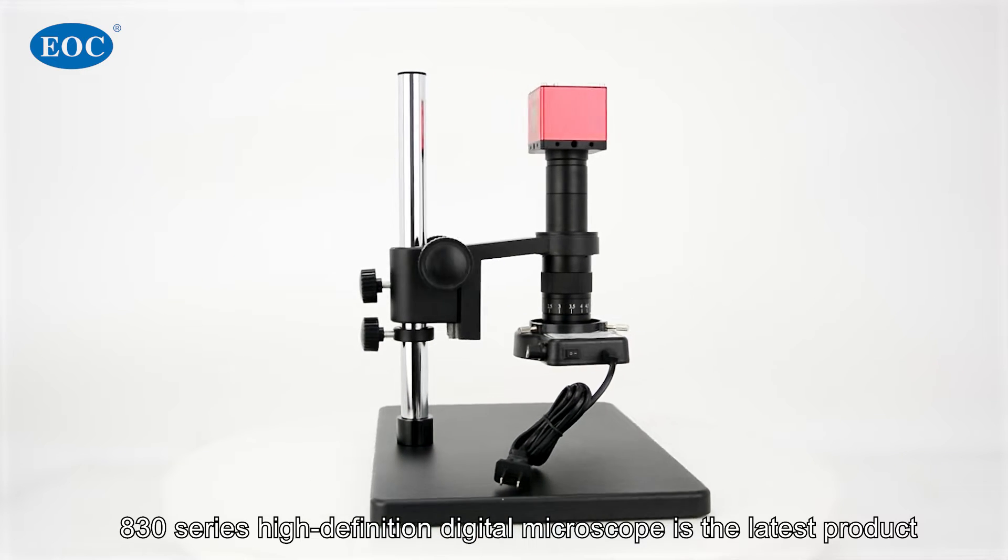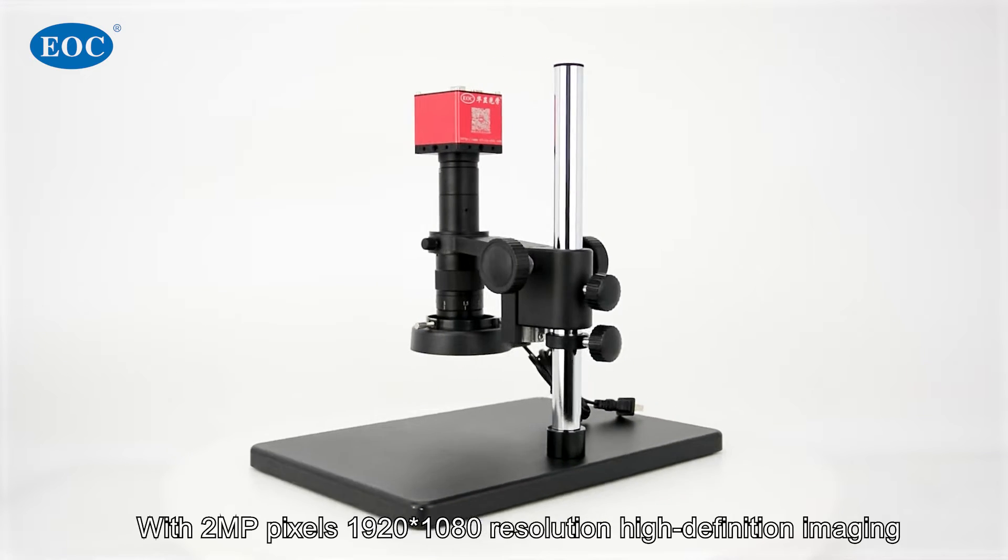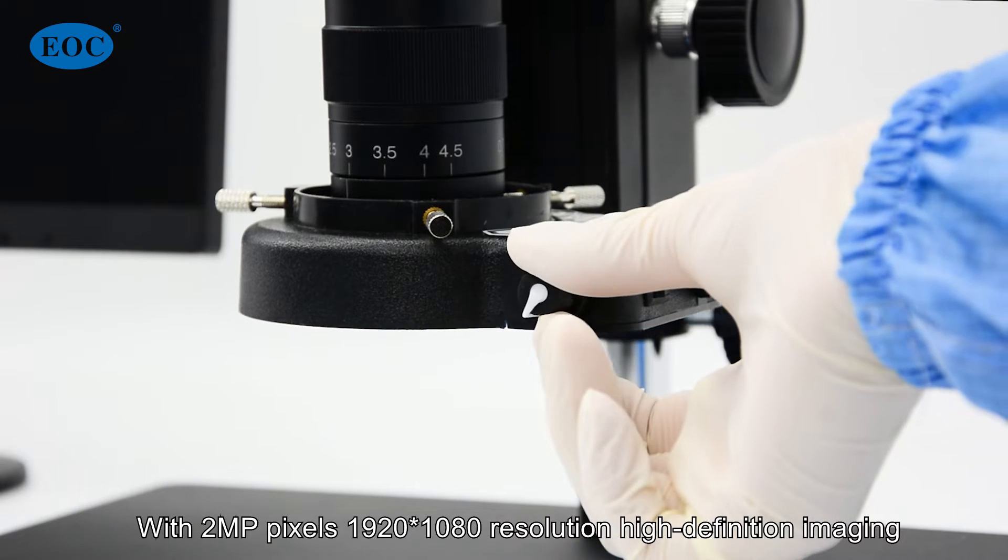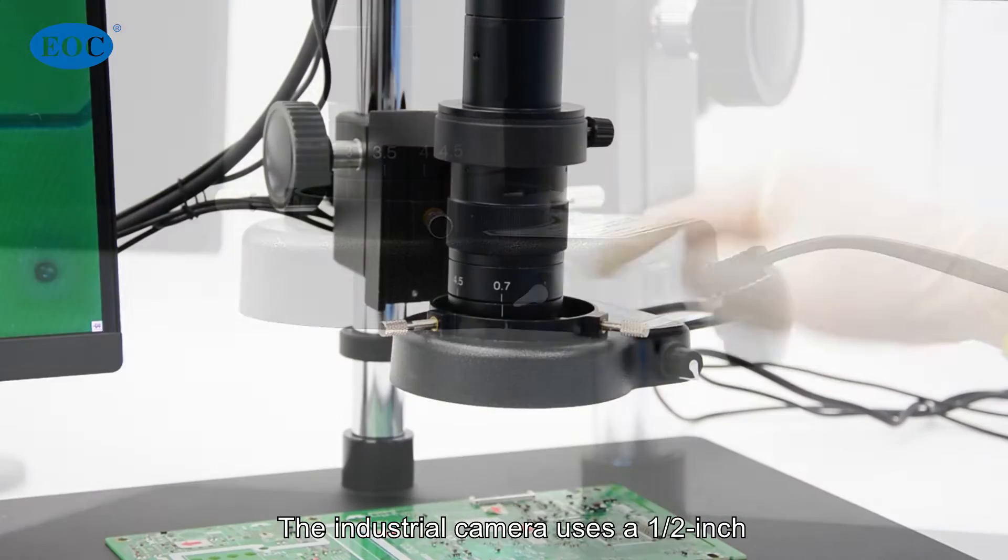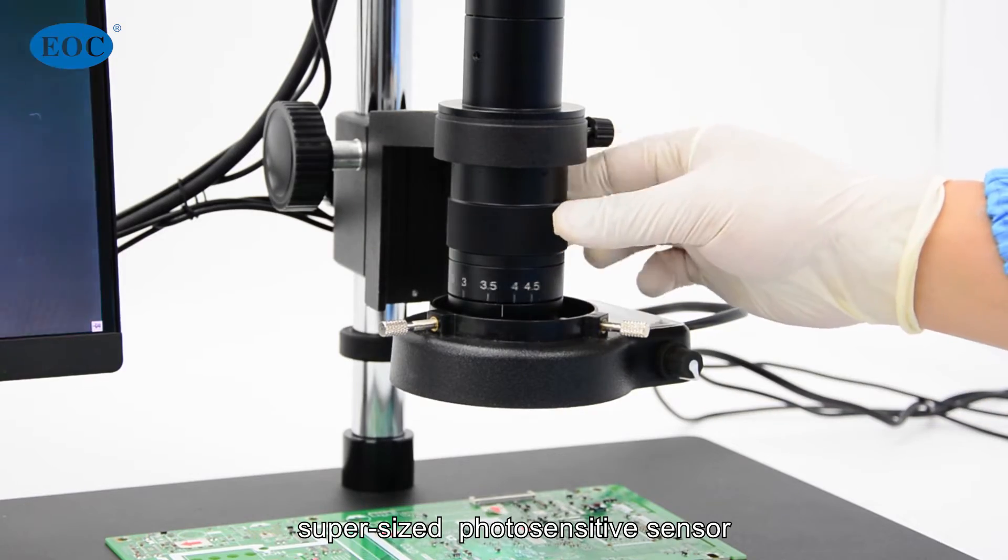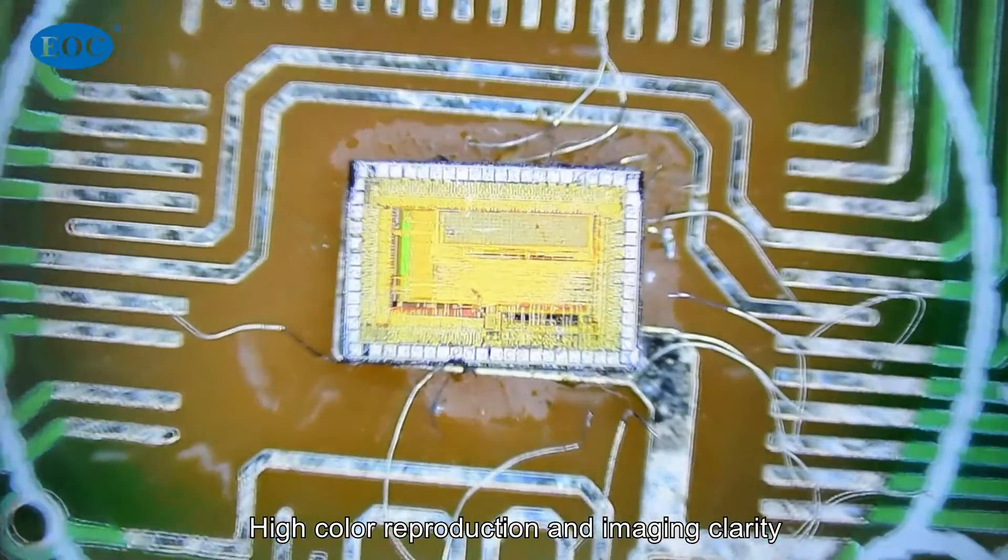The 830 series high-definition digital microscope is the latest product of EOC company, with 2MP pixels, 1920 by 1080 resolution, and high-definition imaging. The industrial camera uses a half-inch supersized photosensitive sensor with high color reproduction and imaging clarity, which is the best of the same level of microscopes.